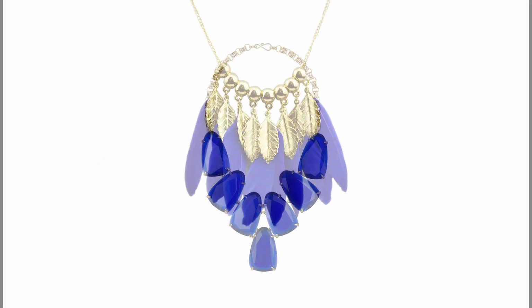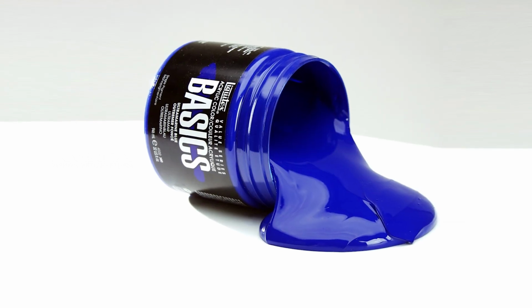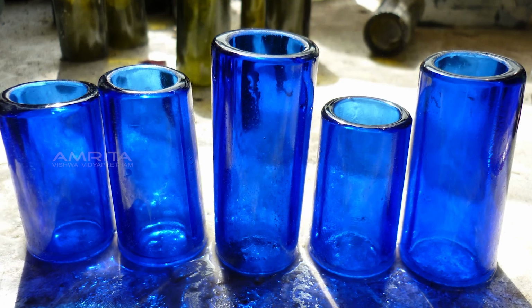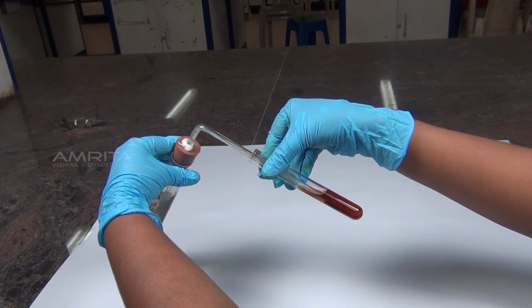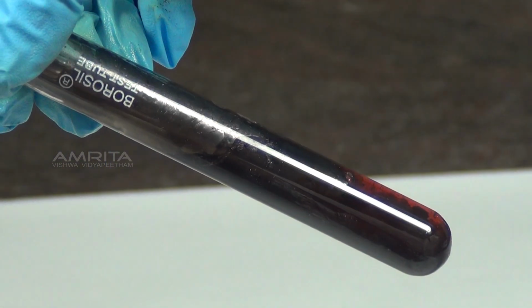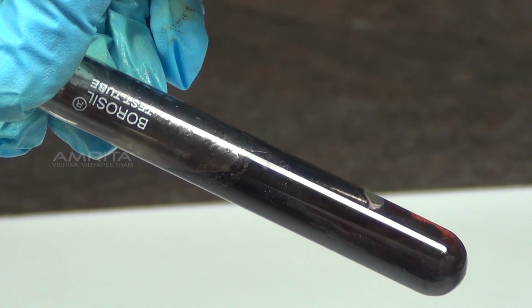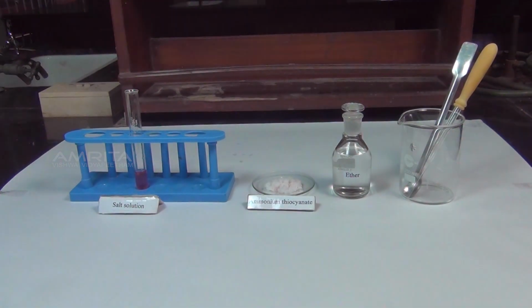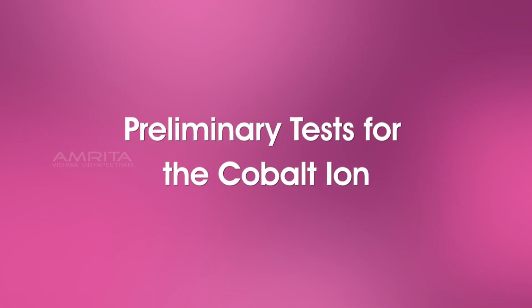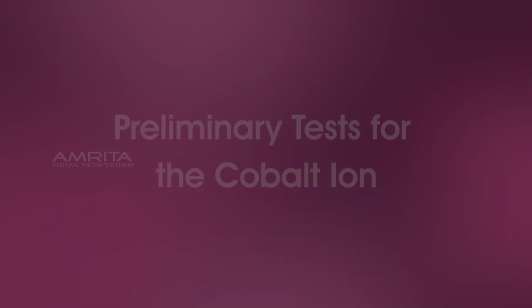Cobalt-based blue pigments like cobalt blue have been used for jewellery and paints and to impart a distinctive blue tint to glass. In group 4, cobalt ions are precipitated as their sulphides by passing hydrogen sulphide gas through their solutions. Our aim here is to test for the presence of cobalt ion in a given salt. First, we look at the preliminary tests for cobalt ion.